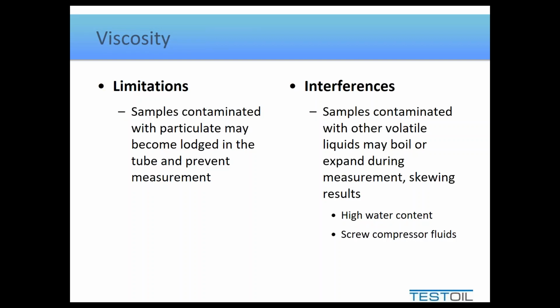So this sets up an interesting argument. We know that these process gases always push down the viscosity value, typically quite significantly. Oils that normally run at 150 centistokes as a new oil value may be half that value in operation due to all the compressed gases in them.